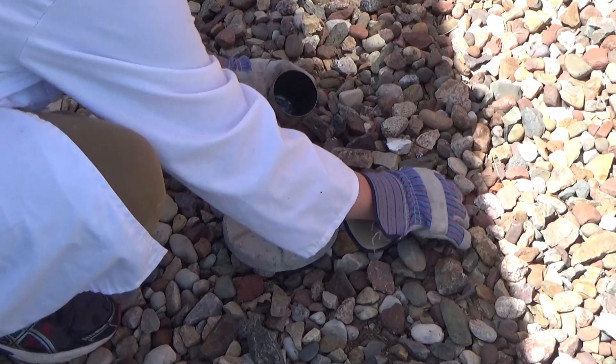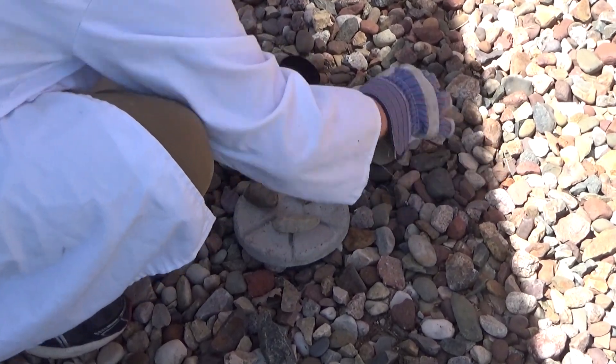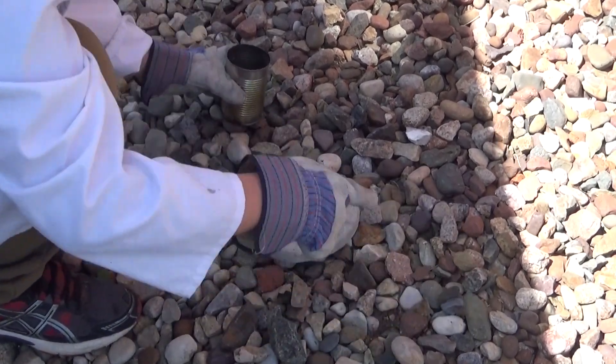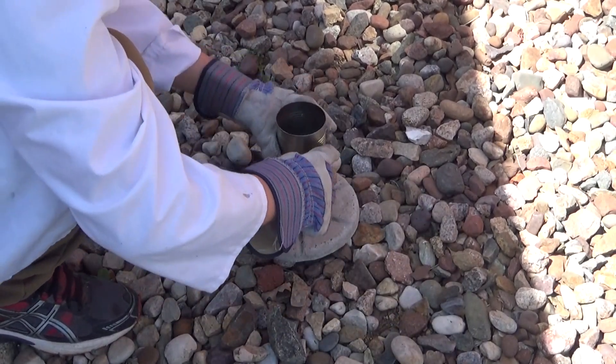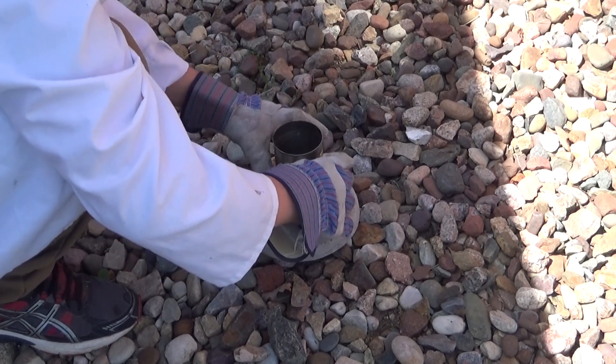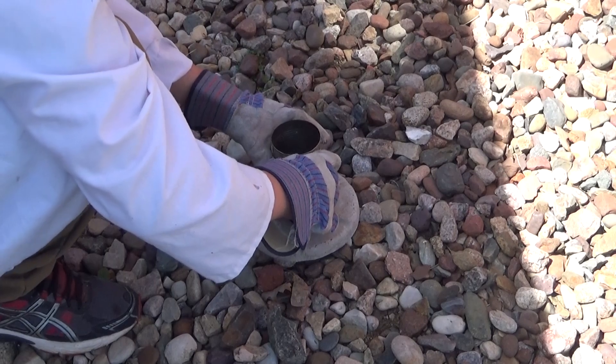Not good, not good. I think I recovered — that's why I'm doing it on rocks. If that happened on grass... actually, let's look at the rocks. It actually wouldn't have been that much of a deal.